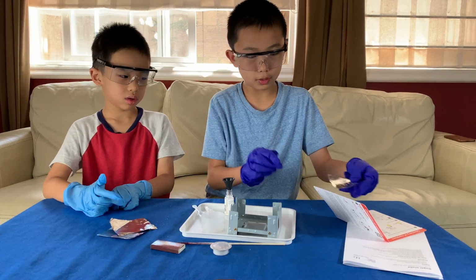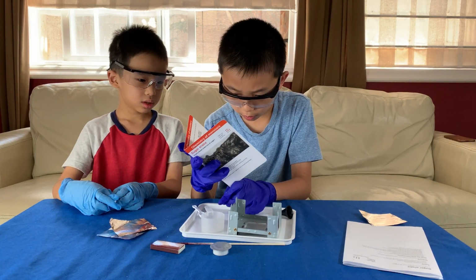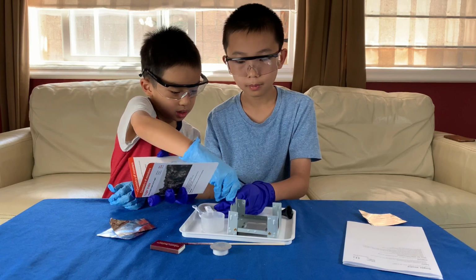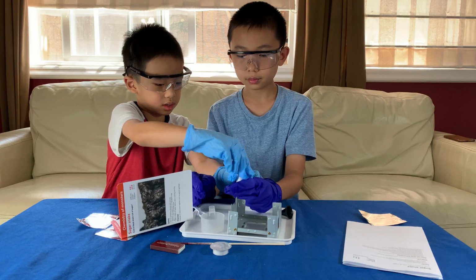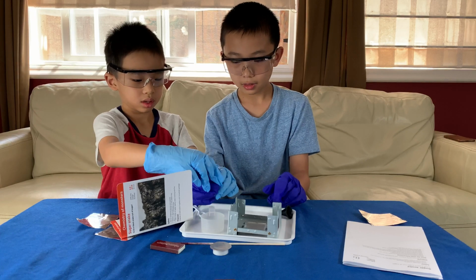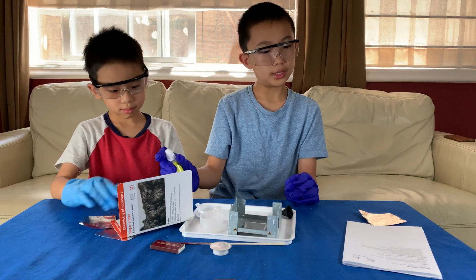Okay, now I'm just going to do this. Alright. See, alright, careful. A bit of blue cloth kind of went inside. Blue cloth? Yeah, it stuck to the sugar somehow, like a tiny piece. Is it stuck on? Is it good? It's good. Now shake it for 10 seconds.